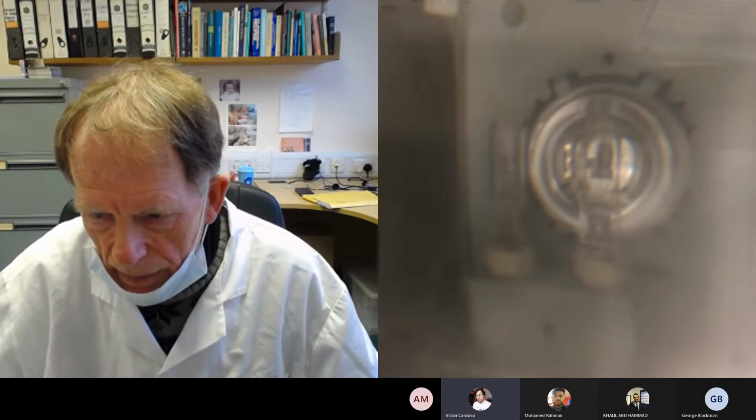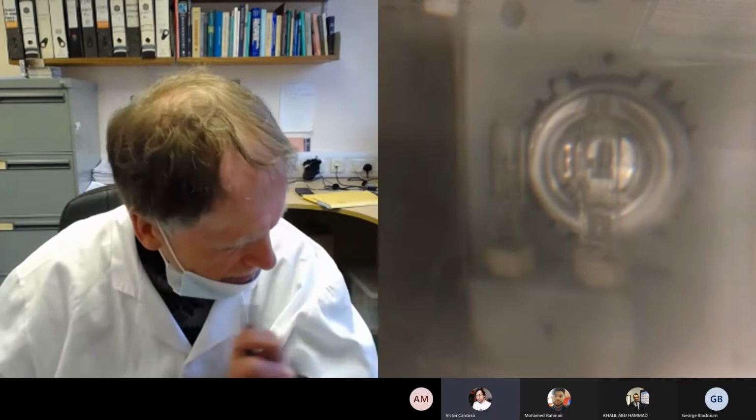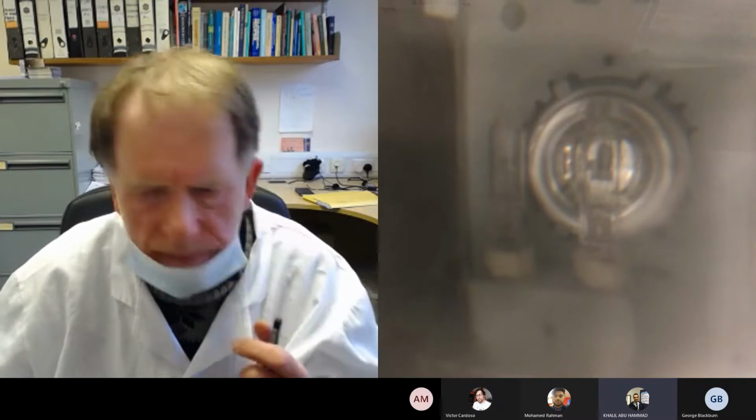Amber, George, Mohammed, Khalil, Victor, what do we get? For the second reading, the 2.641 absorbance, I also got 0.103 grams per mil, so I guess I've done something wrong. Steve, I want to double check about the protein, which is ovalbumin? Yes.